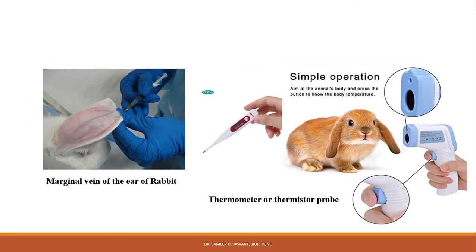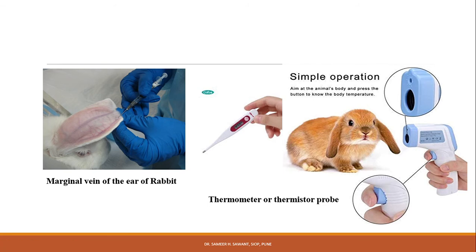This is the marginal vein of the ear of the rabbit, and this is the thermometer by which we can record the rectal temperature of the rabbit. Nowadays, an advanced digital thermometer can be used to record the temperature of the rabbit.